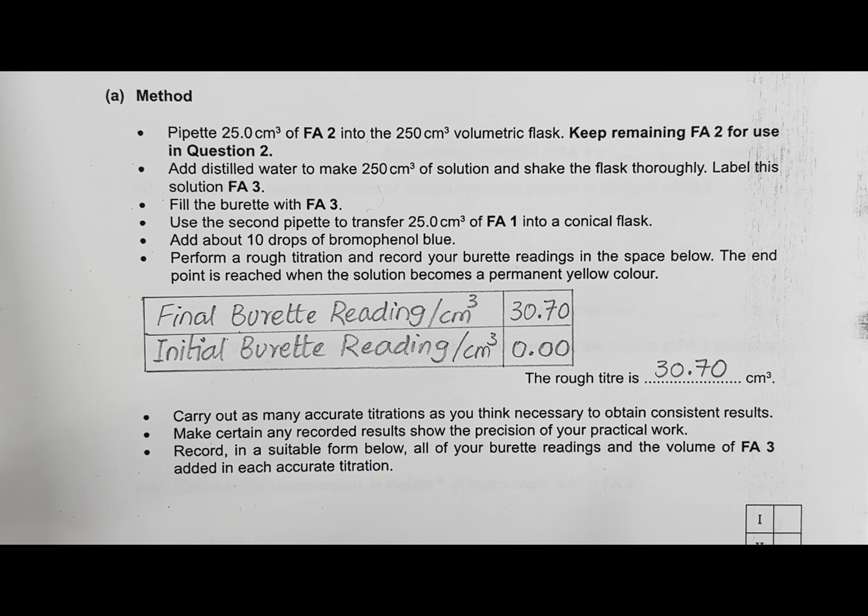Now let's move on to the next part where it says carry out as many accurate titrations as you think necessary to obtain consistent results. Now what is meant by this term consistent results? Consistent results means when you repeat the experiment, you will ideally get the same titer value. Other than this rough titer, if you repeat the experiment, whatever value you are getting, you must get that value again and again.